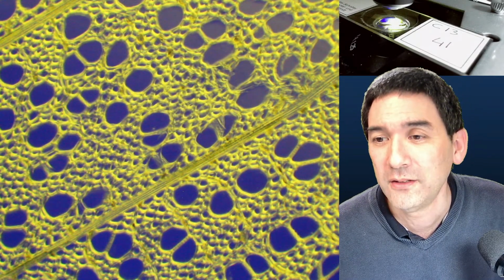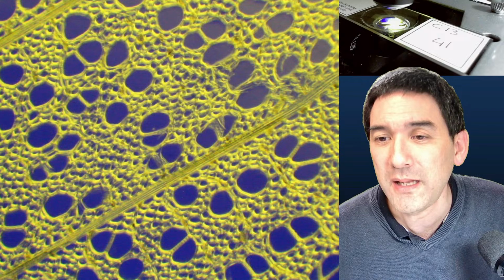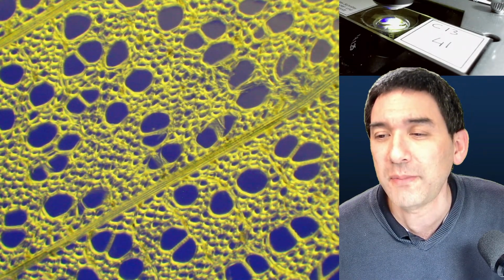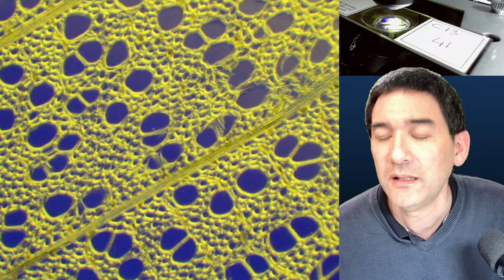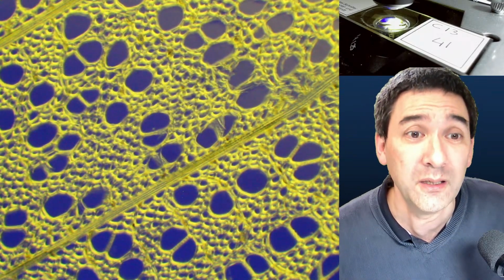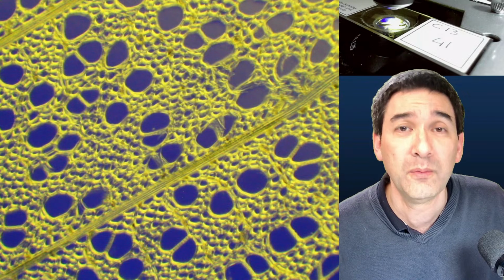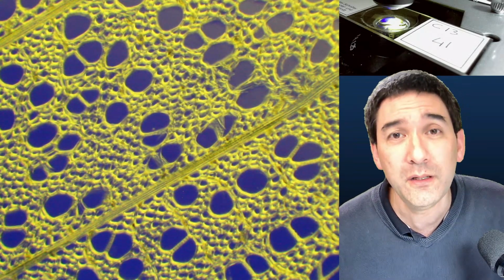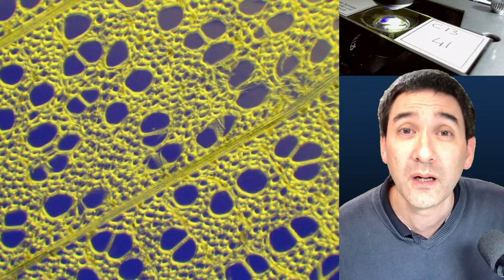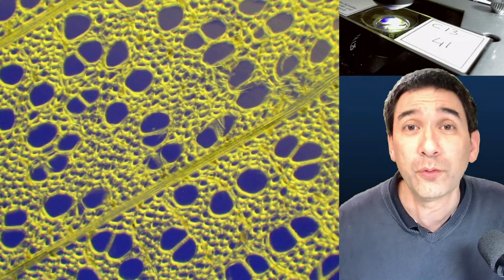I did not realize that wood had so many spaces. Well, these are the cells, right? In the sample, it has a lot of spaces. Is that the case in living wood too? Well, it depends which part of the wood you're looking at, because the wood carries water, and many of the cells, especially the central part of the cells in wood, are dead. But there are long tubes that are carrying water.